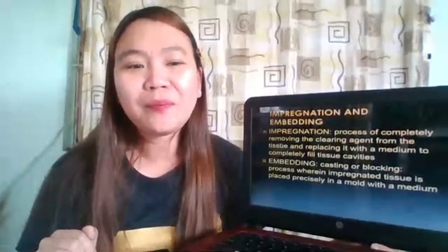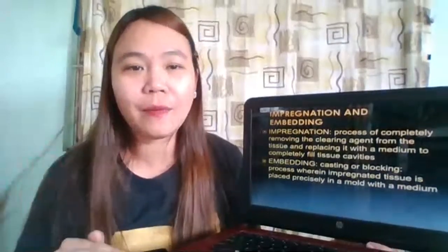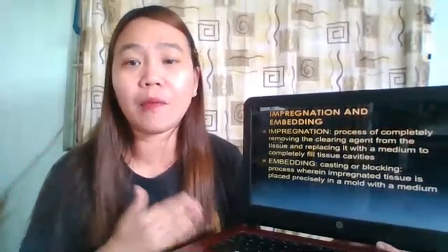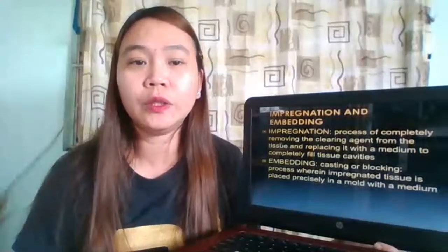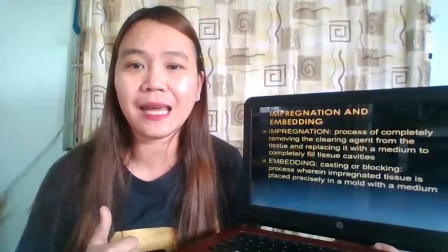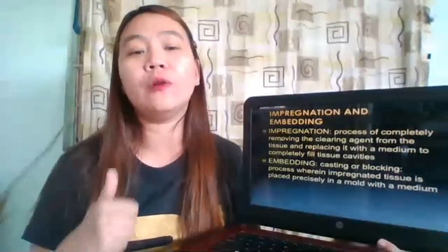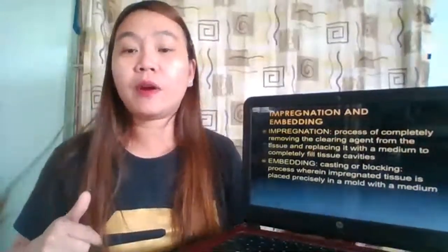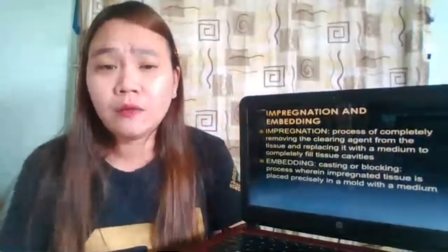Okay, anyway, let us now move on to the next step, and that would be embedding. When we say embedding, other terms used to refer to this would include casting or blocking. So what do we perform during the embedding process, or what is this process?